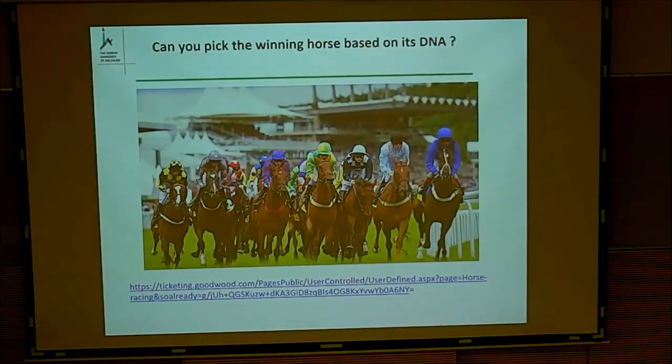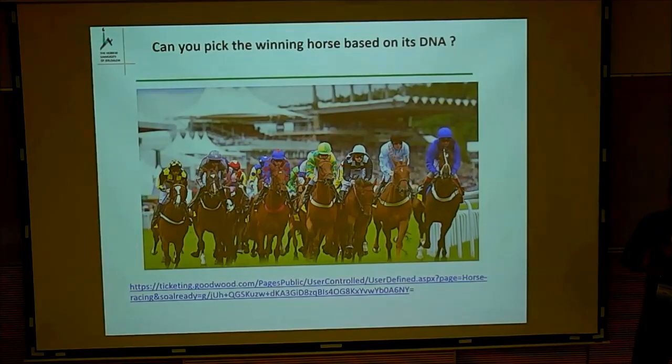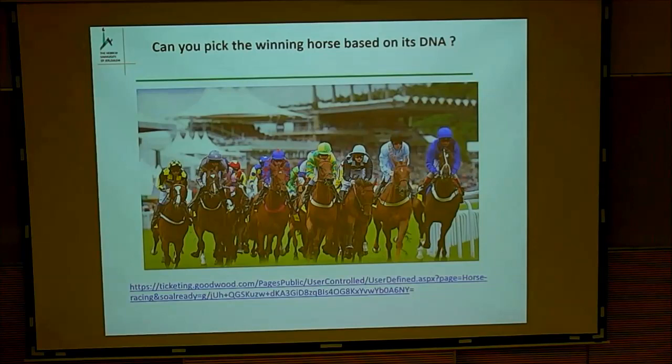So why do we need functional phenotyping? Because it doesn't matter what you're going to do, and doesn't matter if I give you the DNA of each one of these horses, you're never going to know who is going to win the race. The functional means, okay, we have a lot of data about how they look, about their RNA, DNA, protein, but in order to measure something with interaction with the environment, we must use some system that actually measures the plants on the run. Okay?